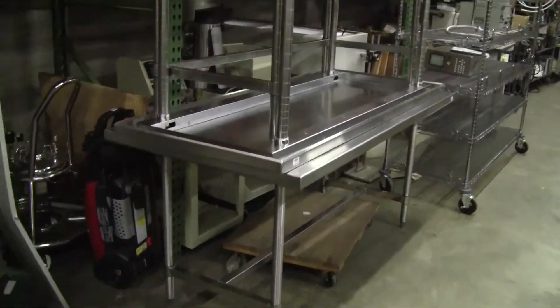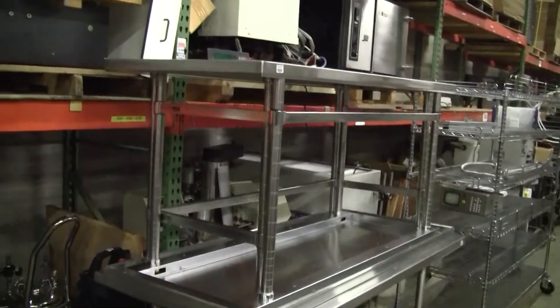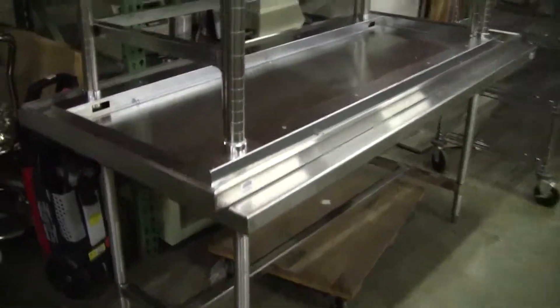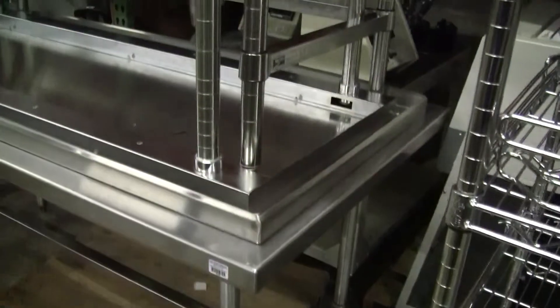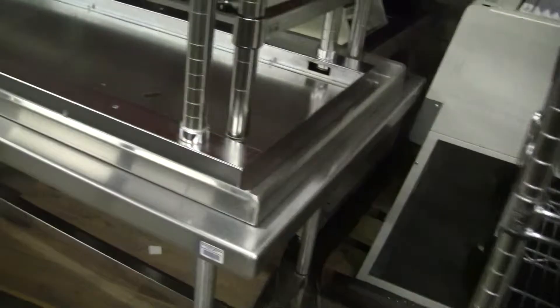Hi, this is Jim from High Tech Trader. Today we're looking at three identical Metro stainless steel tables. They're all 14 gauge stainless steel. They are 34 inches high, 30 inches deep, and six feet wide.